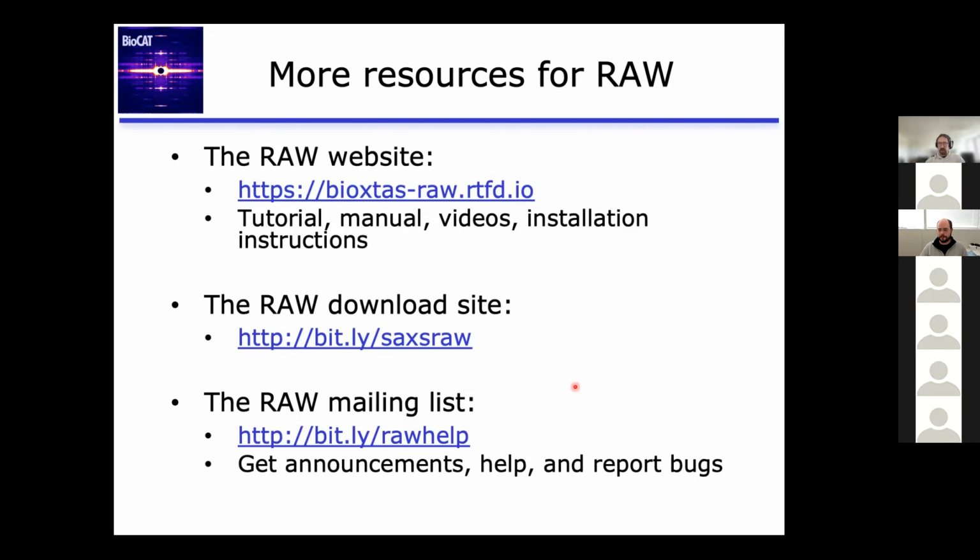So, another question that's come in. So you'd mentioned compatibility with Primus. Is there a way to extract data to use it for another software for plotting? And the Origin software was the specific example. That's not one I've heard of, so I don't know what formats that uses.